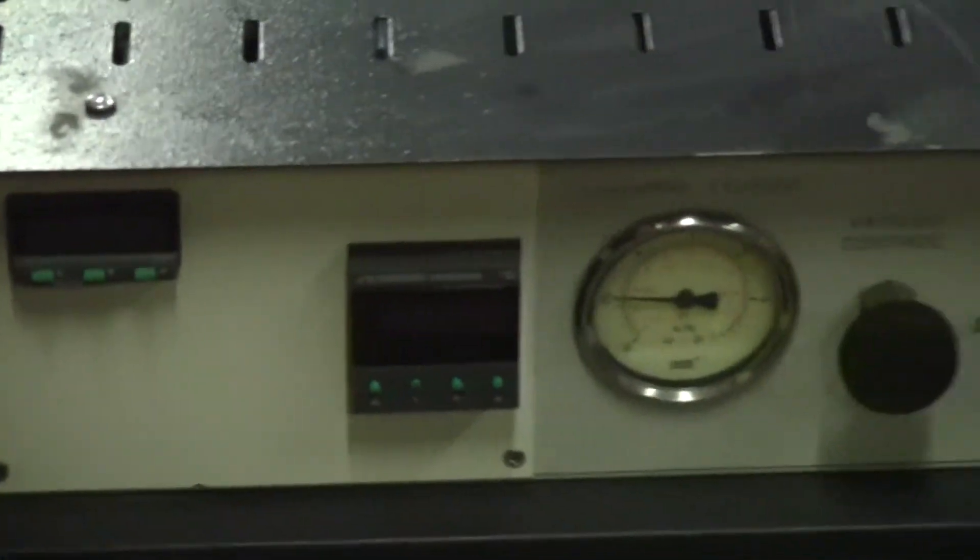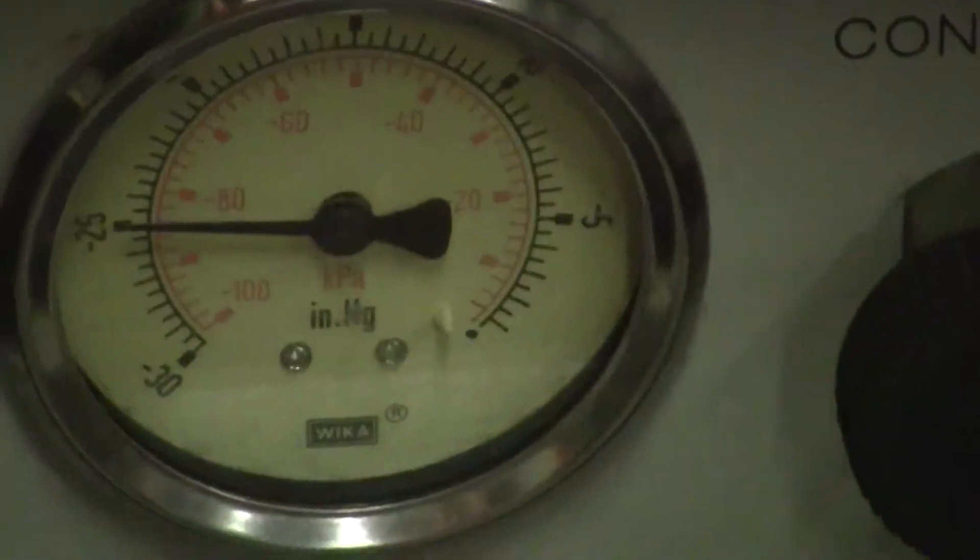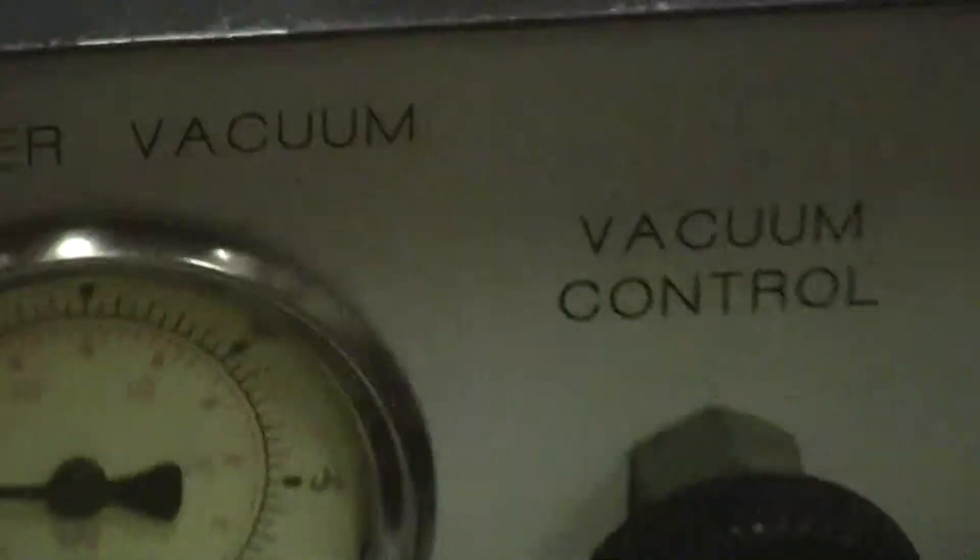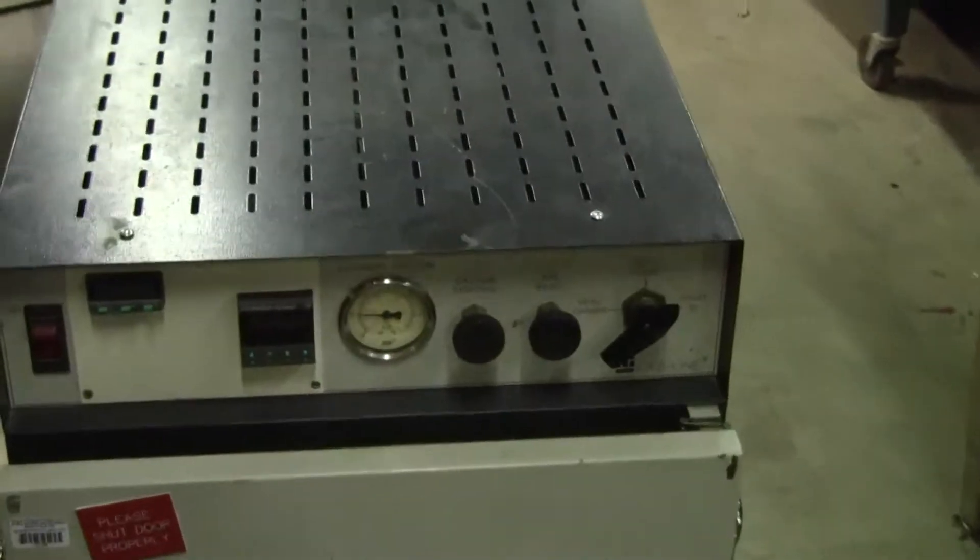What we've done is we've put the oven under vacuum. You want to see it hold.